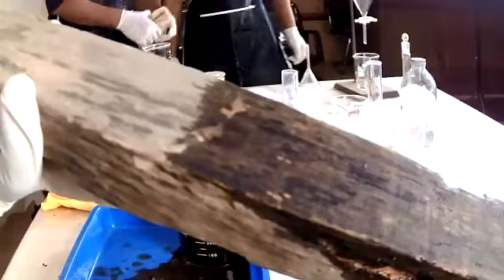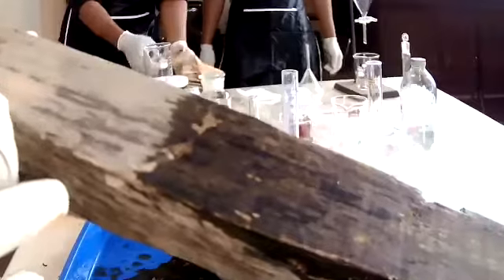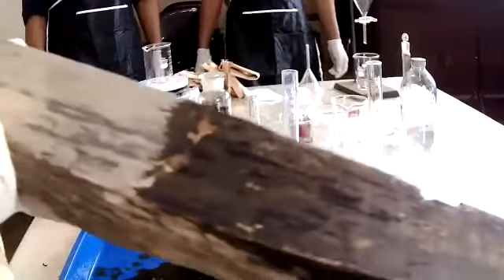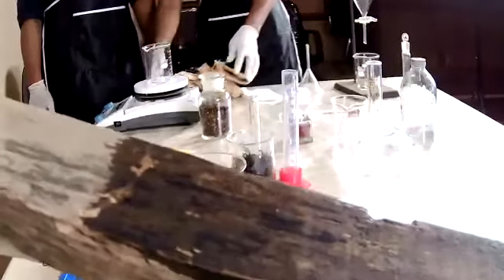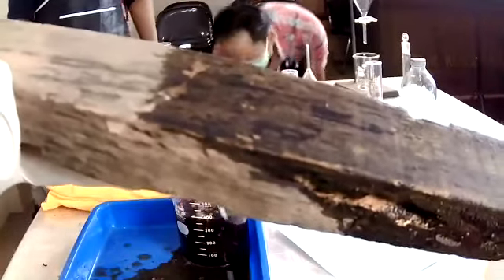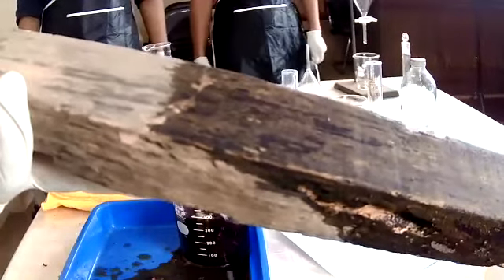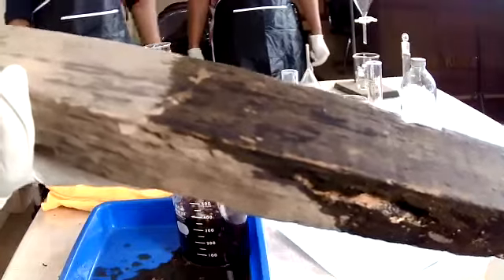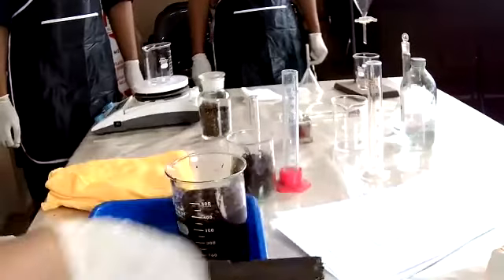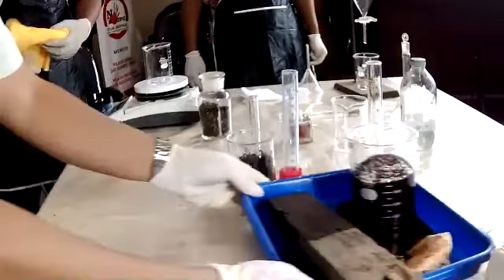And this treatment can be done a few times or several times because you want to make sure that the active properties of the solution work well for the wood. So this method originated from a tradition of Kudus people in Central Java area, that usually they take care of their wood house and their wood furniture using this solution.